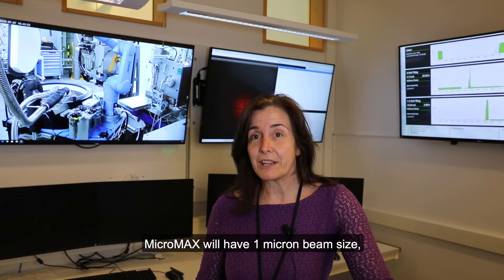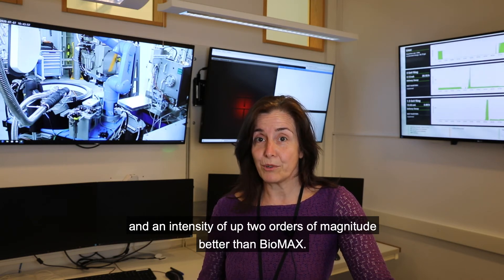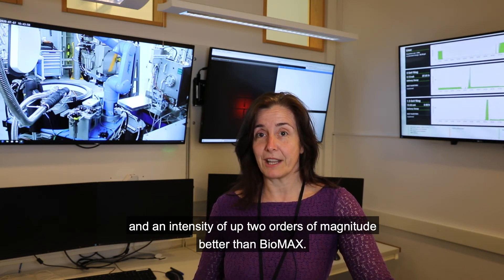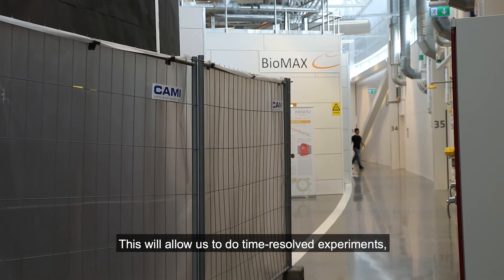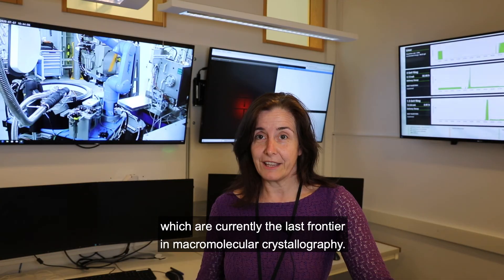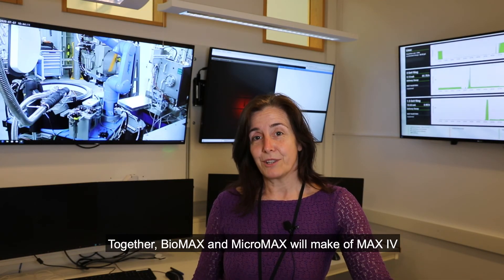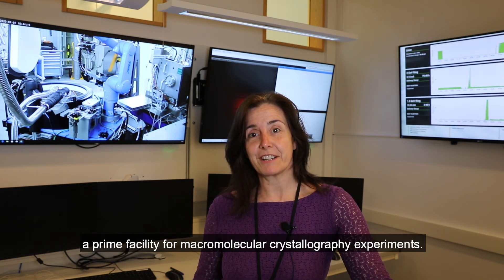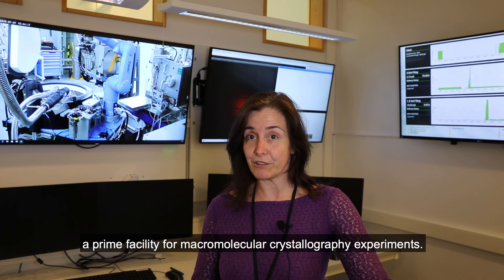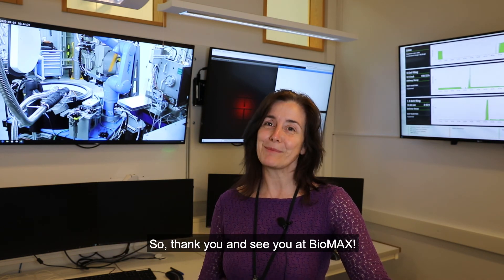Micromax will have a one-micron beam size and an intensity of up to two orders of magnitude better than Biomax. This will allow us to do time-resolved experiments, which are currently the last frontier in macromolecular crystallography. Together, Biomax and Micromax will make MAX IV a prime facility for macromolecular crystallography experiments. Thank you, and see you at Biomax.